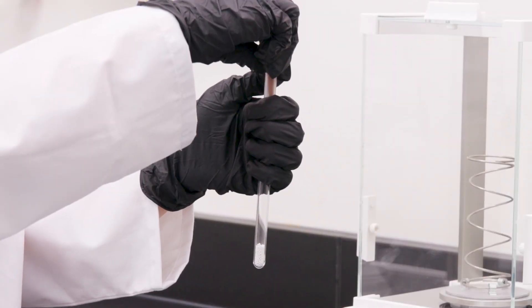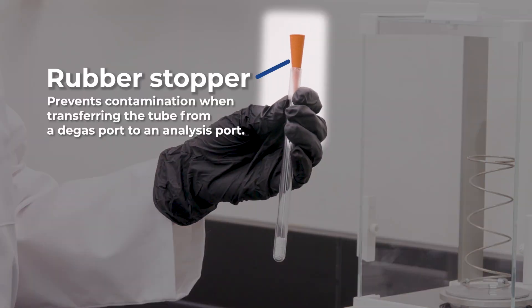If the sample does not contain micropores, a rubber stopper prevents contamination when transferring a sample tube from a degas port to an analysis port.